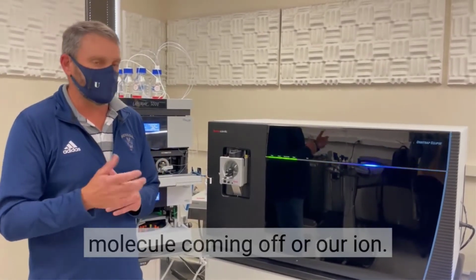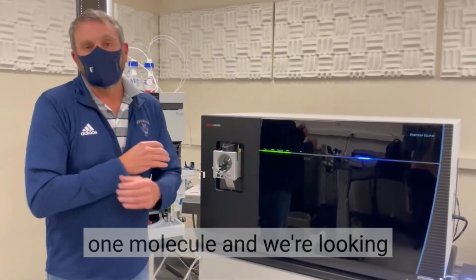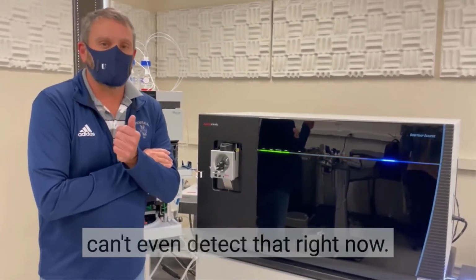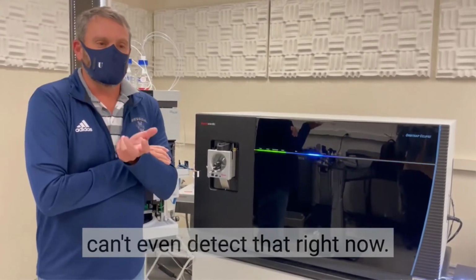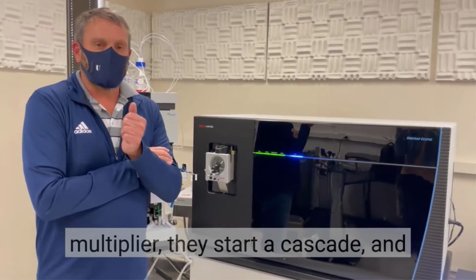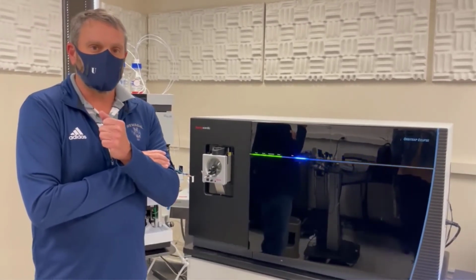coming off, or our ion. Because again, we can't see one molecule, and we're looking at only a few hundred, and we can't even detect that right now. So these molecules strike our electron multiplier, they start a cascade, and then we can actually see that signal.